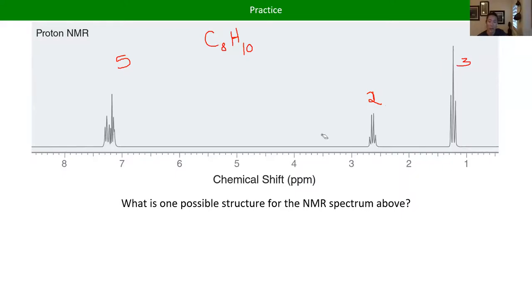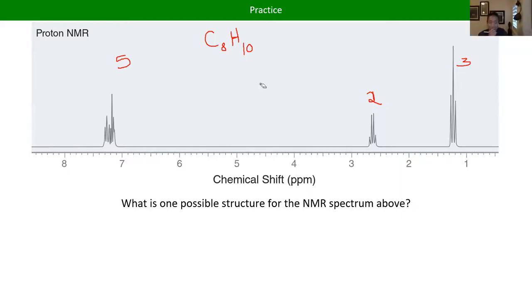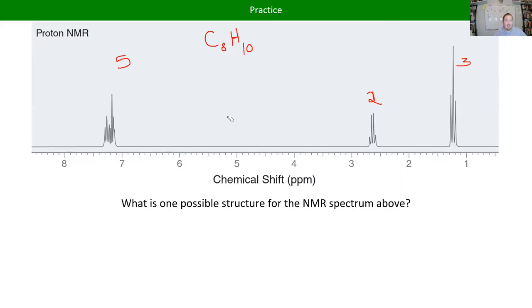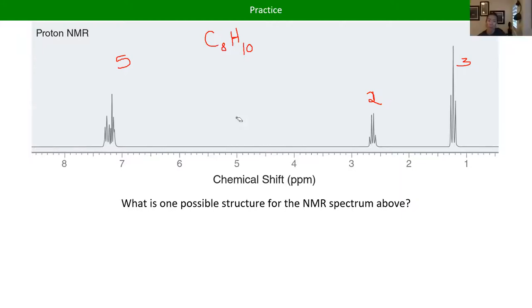So yes, integration should always add up to the same number as your hydrogens in the formula — though occasionally an OH hydrogen won't show up in an NMR depending on the type of NMR. So occasionally you can be off by one, and that usually means you've got a hydroxyl group — an alcohol — in there.